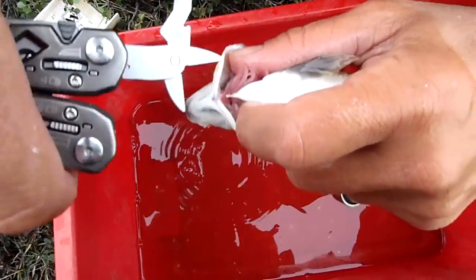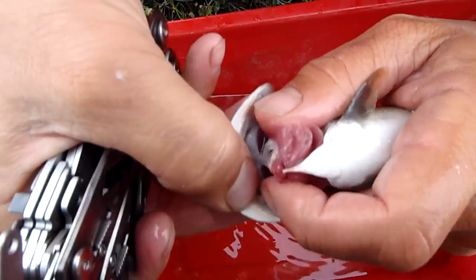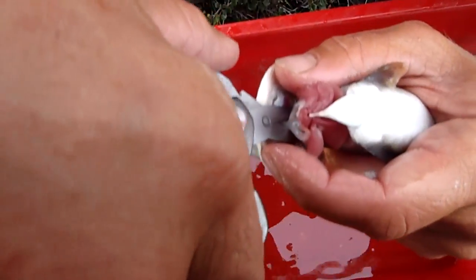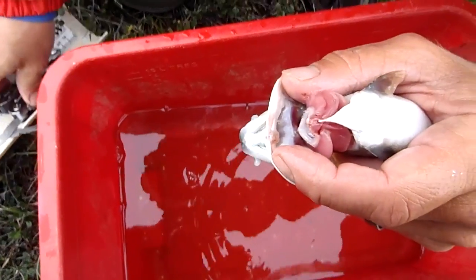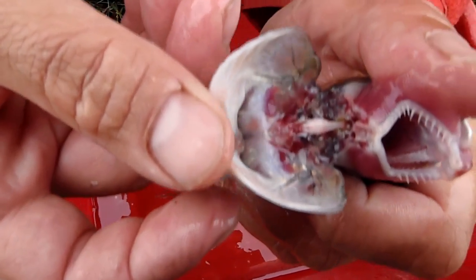Peel back the head a little bit and open them wide open here. How does that look down in there? Okay, see this where my thumb is — right there is where we're going to make our next cut. It's going to be a little deeper. There we go. We should be able to peel back his head and find some otoliths waiting for us. There they are.